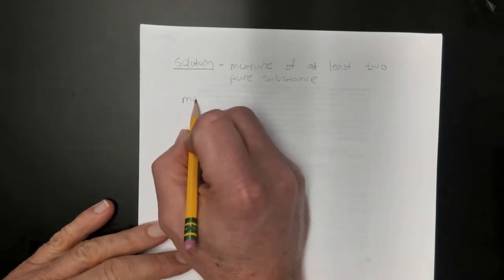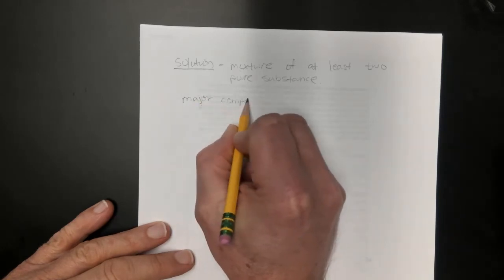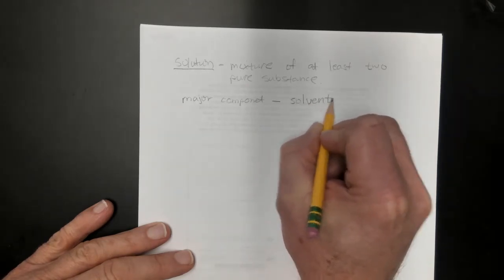The major component is known as the solvent. Solvent. Okay. So in the experiments that we're going to be dealing with in this, the titration of acetic acid, the solvent will be water.